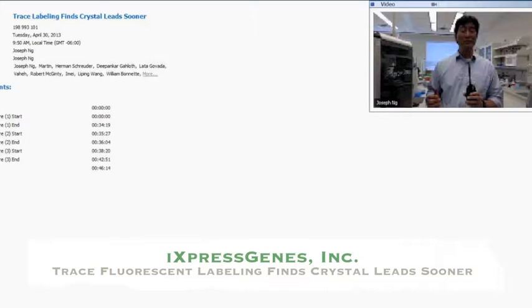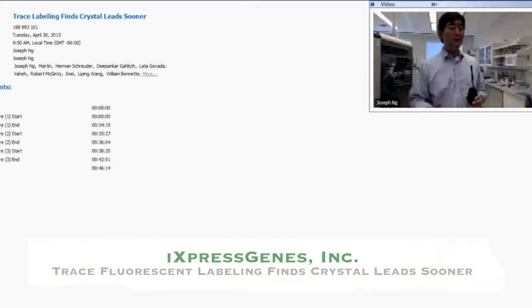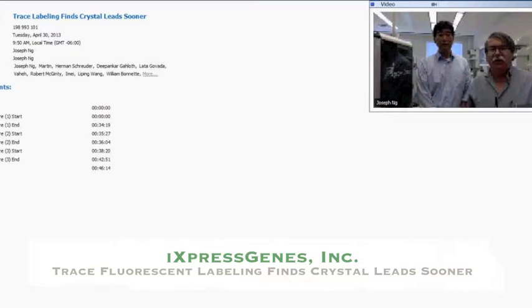Question is, how big is the fluorescent probe, and what's the size that you're allowed to use a fluorescent probe without interfering with the crystallization? When we were initially working this out, I used the same fluorescent probe, which has a molecular weight of 550, and I used it with insulin crystals. There the probe was about 1/10 the size of the protein molecule itself, and we had no problem with the diffraction pattern or crystallization procedure, especially at the trace levels.